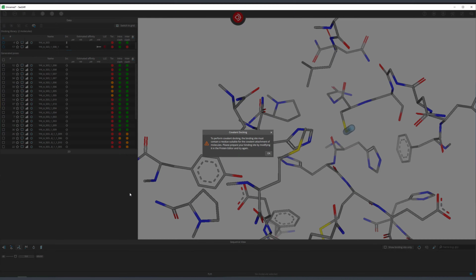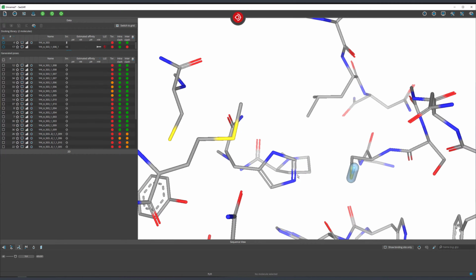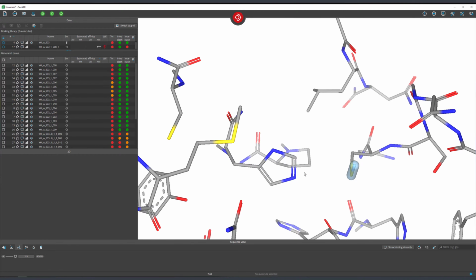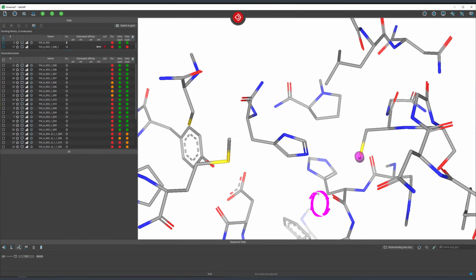This is a convenient way to check on how molecules bind to this binding site in a non-covalent manner, to obtain hints on how the non-covalent properties of these ligands can be optimized. What this teaches us in summary is that a capsule being marked blue means that the residue has been marked for covalent docking but not necessarily selected for covalent docking, while the one that is marked pink by clicking on a blue capsule is the one that has been selected for this particular run of covalent docking. And this information is rather critical for the next step that we're going to do.